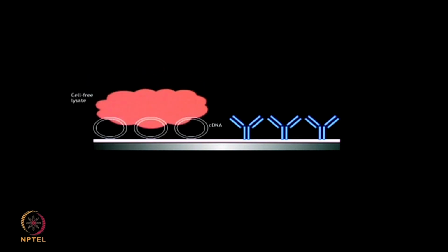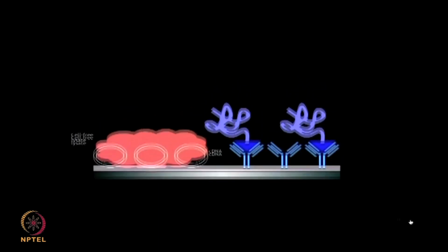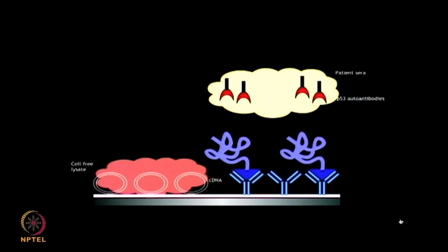In this study, the authors generated protein microarrays based on NAPA expression. As you can see, in the NAPA chemistry, cDNA, BS3, BSA and capture antibody, these four features are printed on the chip surface as a master mix.